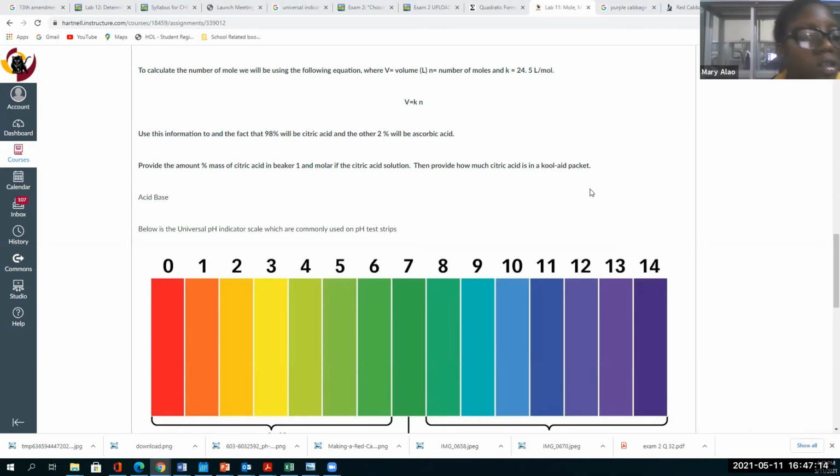After noting all this stuff, the color change, what's next? Then you're good. I'll put up the questions, and you'll answer them. I'm in the process of fixing that now because I have to modify it because it was for a different type of lab than the one you guys are doing. Okay. That's all right. Oh, so you haven't really put the questions up. Yeah, that's what I was kind of looking for.